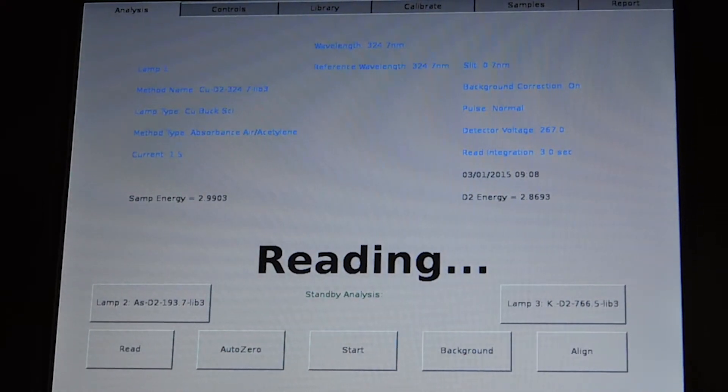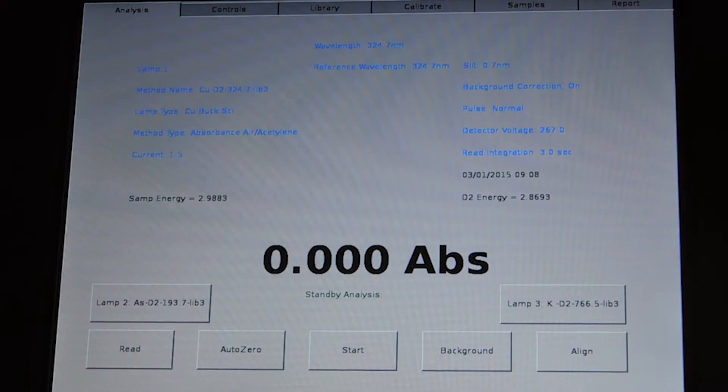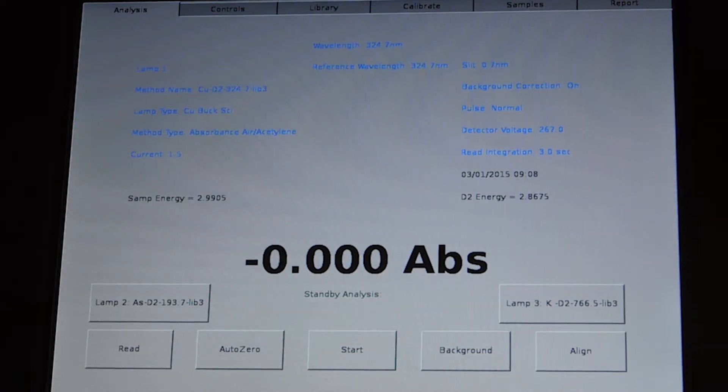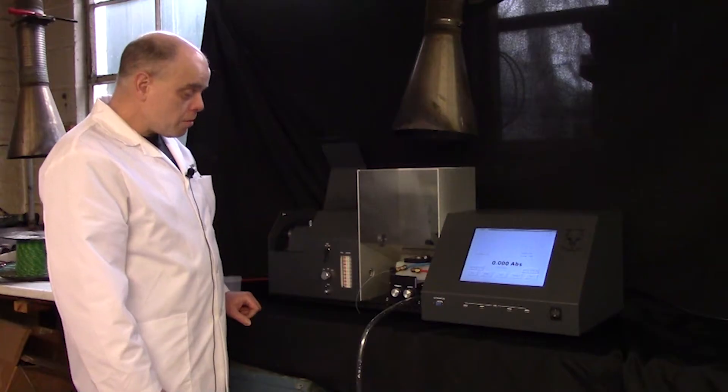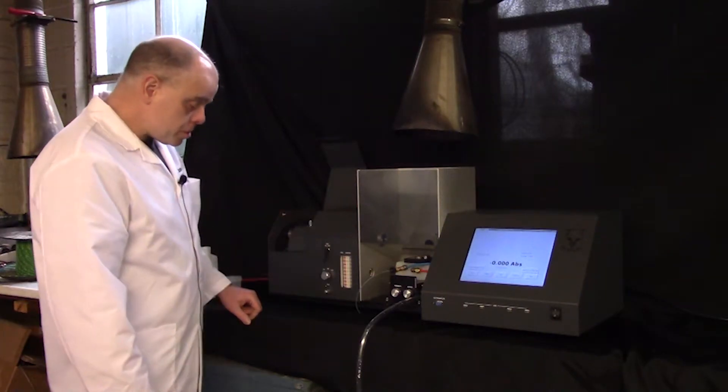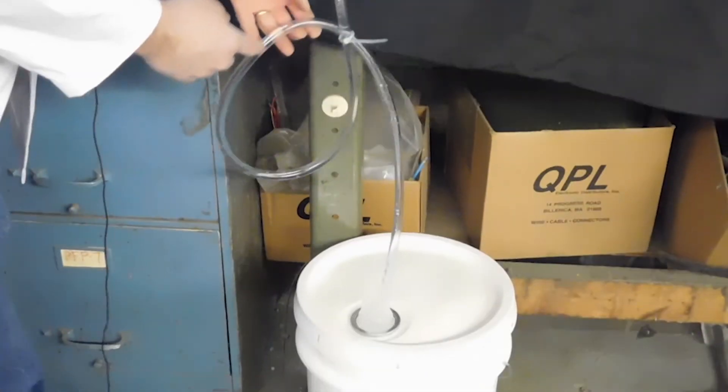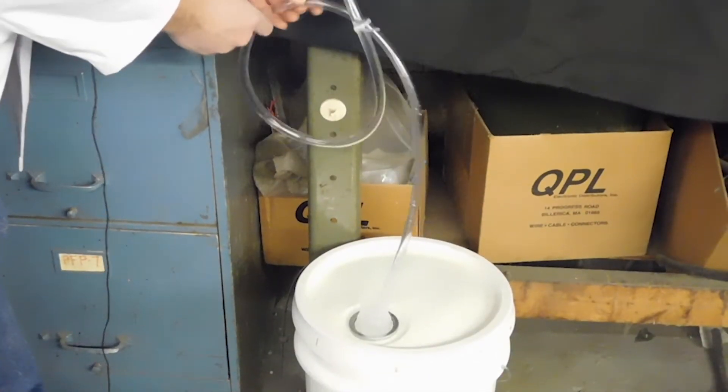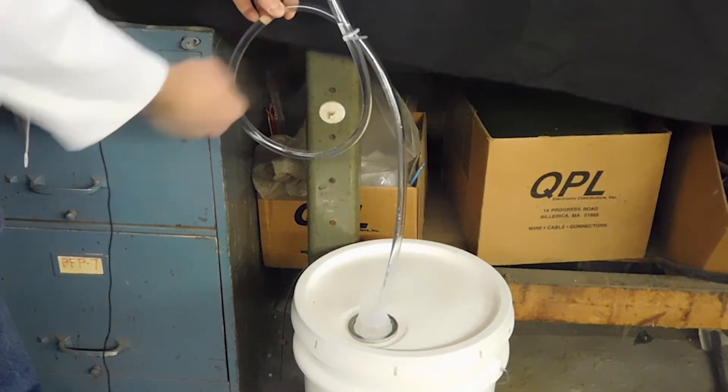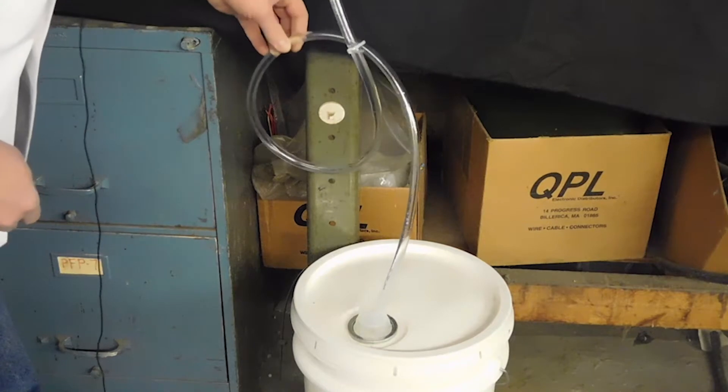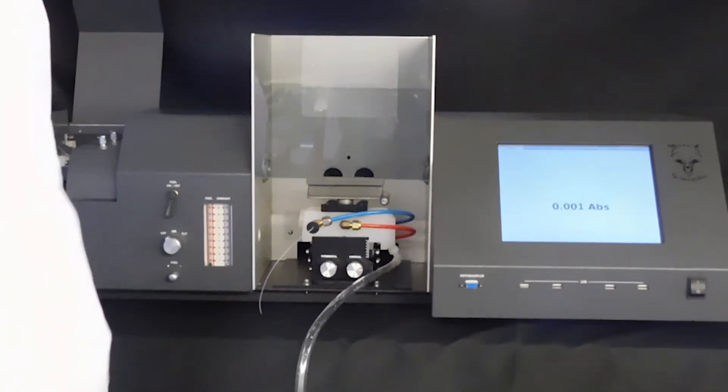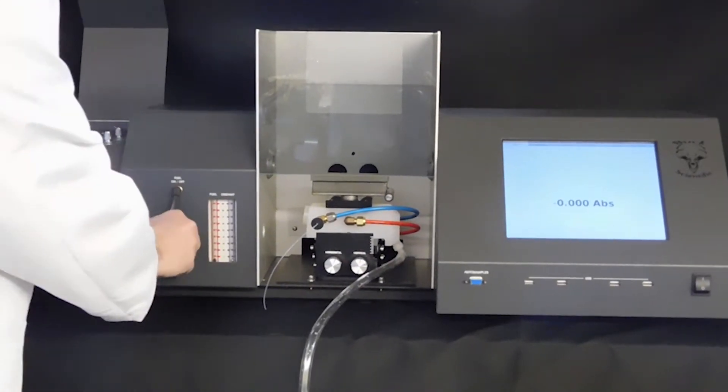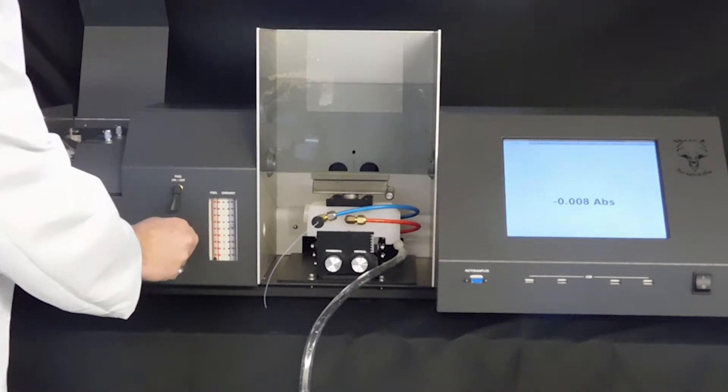And then the instrument is ready to be flamed up. When you're ready to flame the instrument up, first be sure that your drain loop is filled with water. Next, you turn your air on.